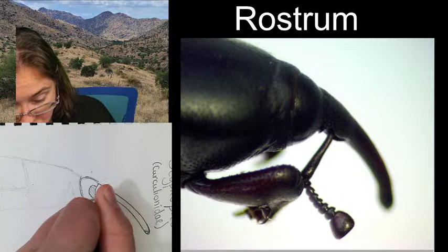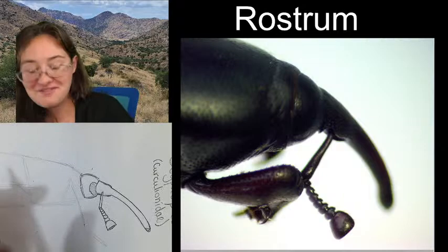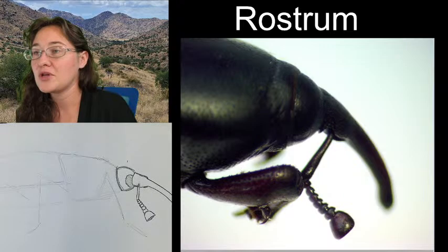Oh, he's so cool. Alright, so I'm already pretty happy with our little weevil, and we only have his head taken care of. So we're gonna be moving back onto his thorax. Keep in mind our thorax is going to be three segmented. The pro, the meso, and the meta, right?